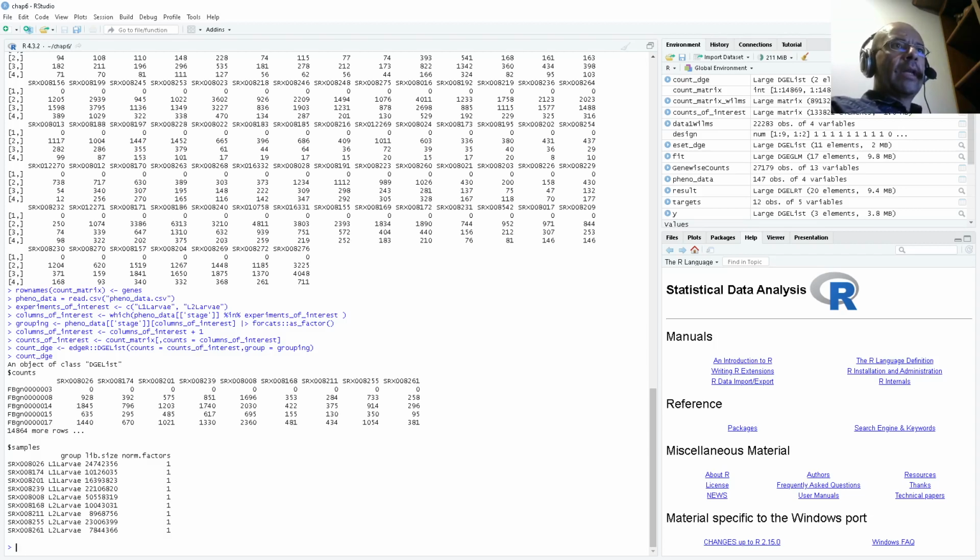Finally, we will dive into differential expression analysis, using statistical concepts such as the negative binomial distribution and the quasi-likelihood approach. This approach helps us estimate the dispersion parameter in the negative binomial model, providing us with valuable insights into gene expression changes.